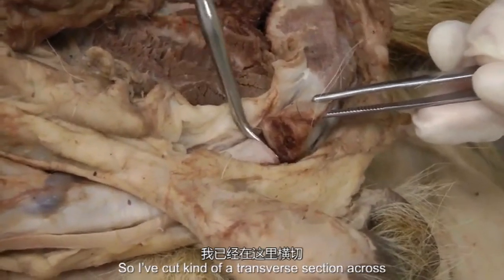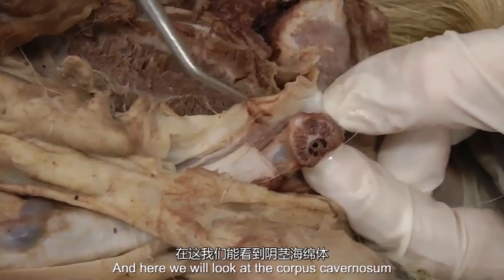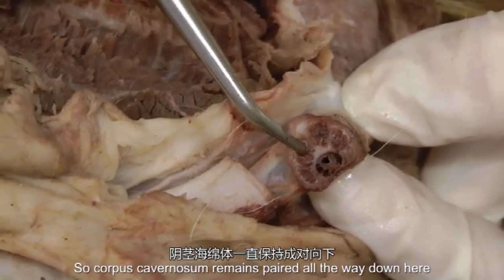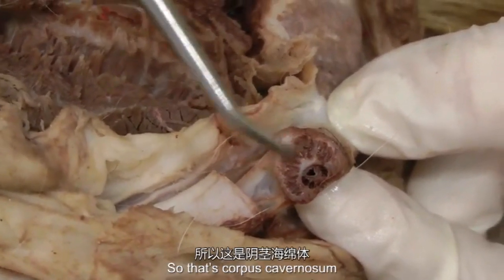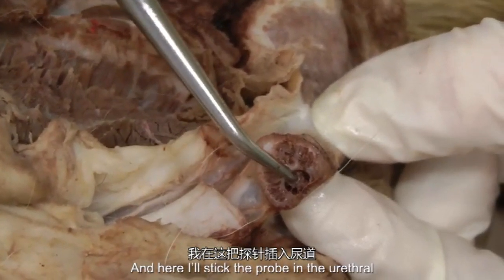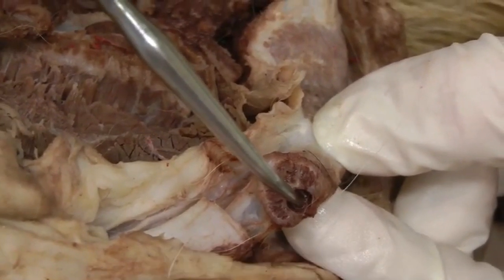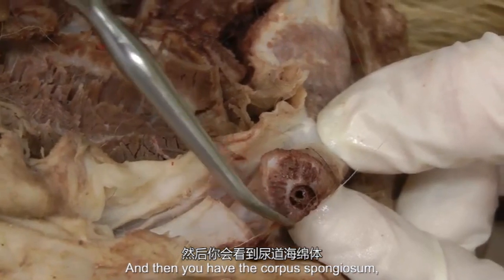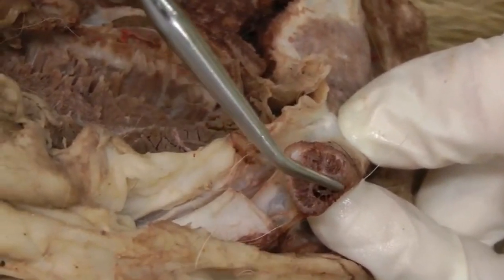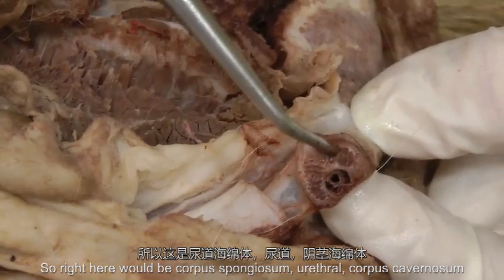So I've cut kind of a transverse section across, and this is just in that body of the penis. And here we'll look at the corpus cavernosum. So corpus cavernosum remains paired all the way down here, so that's corpus cavernosum. The white parts are the tunica albuginea. And then here, I'll stick the probe in the urethra. So the urethra is the little hole in the middle here, ventrally. And then you have the corpus spongiosum. There isn't a lot of it here to look at, but it's surrounding that urethra. So right there would be corpus spongiosum, urethra, corpus cavernosum.